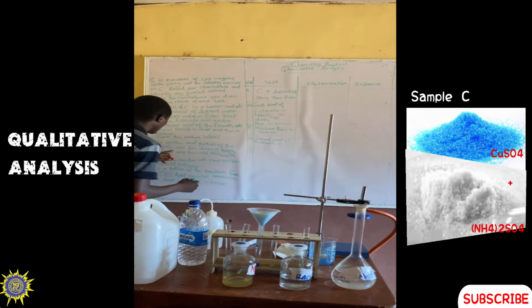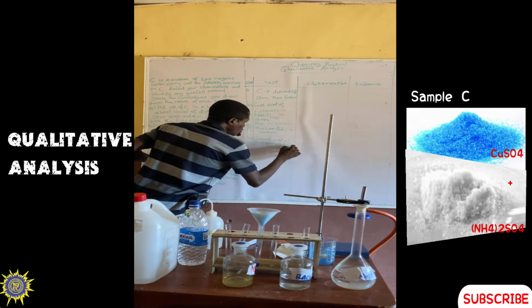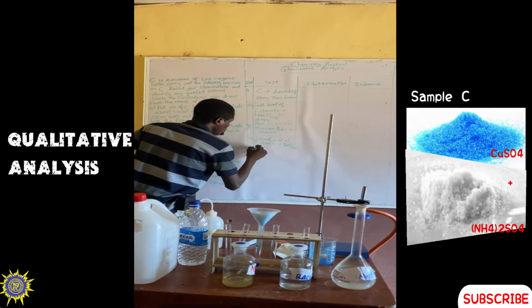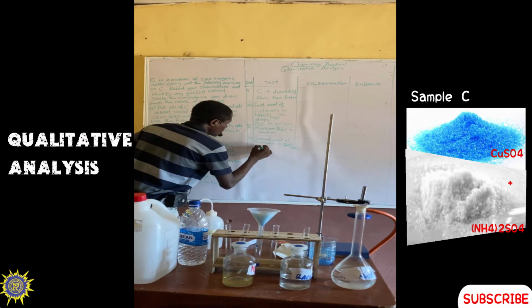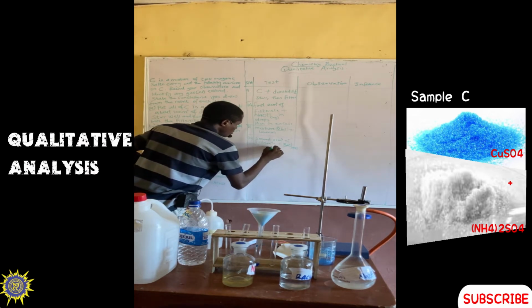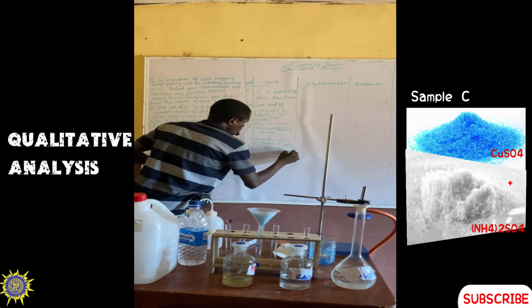Add what? We have to add barium chloride solution, in drops, plus excess HCl. That is aqueous.